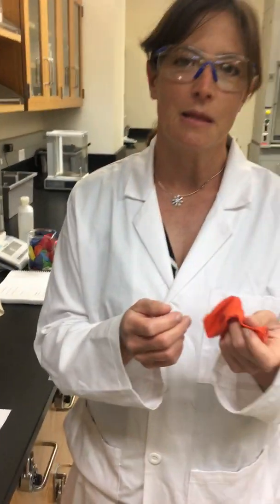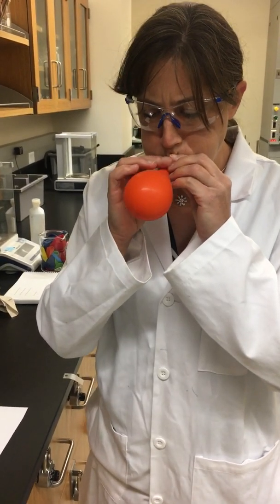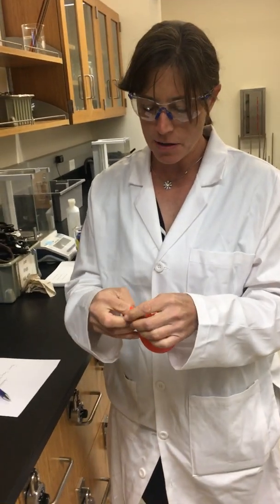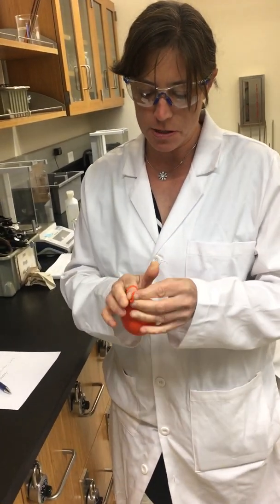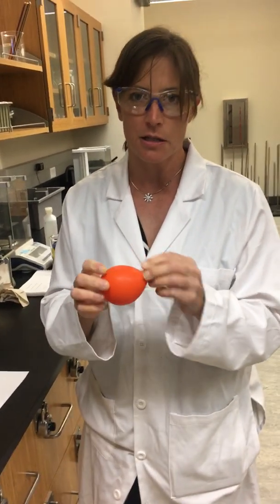So now we're going to take the mass of the balloon after we blow it up, so we can get the mass of our air sample. We're not going to blow it up very much so that our balloon is a little bit less buoyant, because the more you blow it up the more buoyant it is and the harder it is to get the mass.